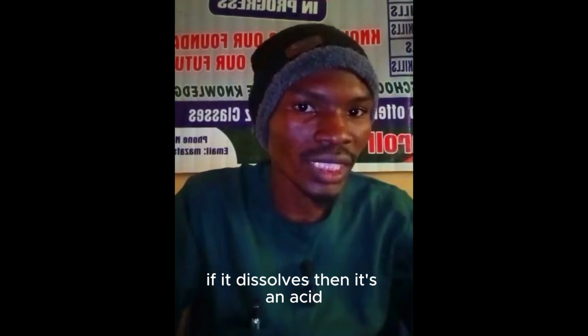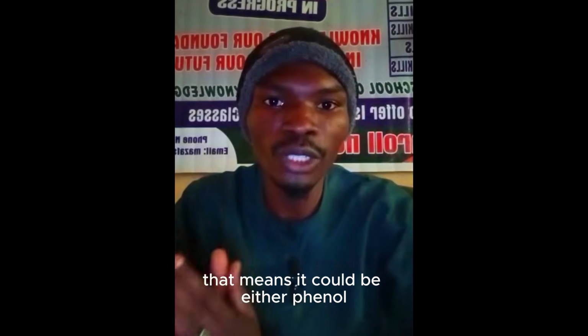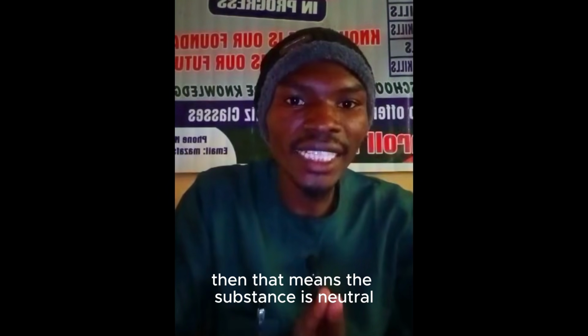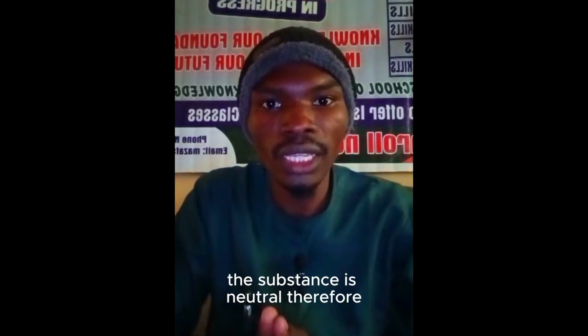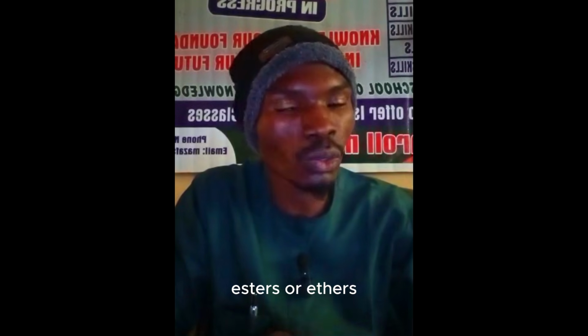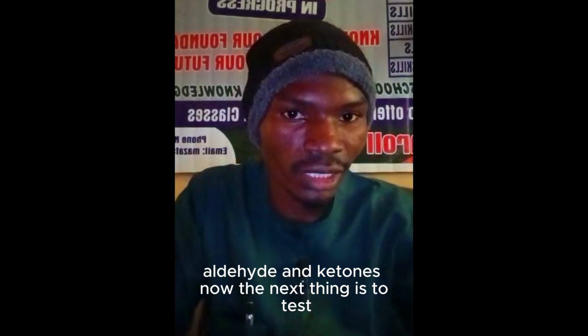If it dissolves, then it's an acid, and that means it could be either phenol or carboxylic acid. Now, if it does not dissolve in both of them, then the substance is neutral. Therefore, it could be either aldehyde, ketone, anhydride, ester or ether. But we are going to limit ourselves to aldehydes and ketones.